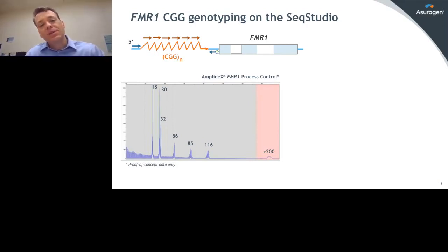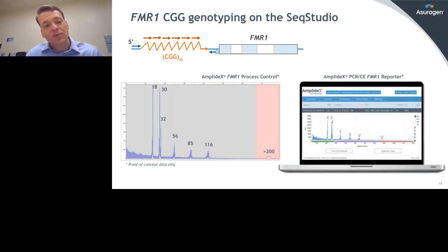And so this sample tells us several things. First of all, it tells us that we can accurately size because the numbers that are labeled for these peaks are in fact the CGG numbers that we know from orthogonal methodologies that represent the corresponding CGG numbers. Secondly, it covers a categorical range from normal to full mutation. And third, we can even see very closely sized repeats, like 30 or 32. So a separation of 2 CGGs we can pick up. I'll show you an example in just a minute of one. So the platform's doing what it should be doing. We're able to accommodate the breadth of both sizing for longer repeats as well as the precision and accuracy for shorter repeats.